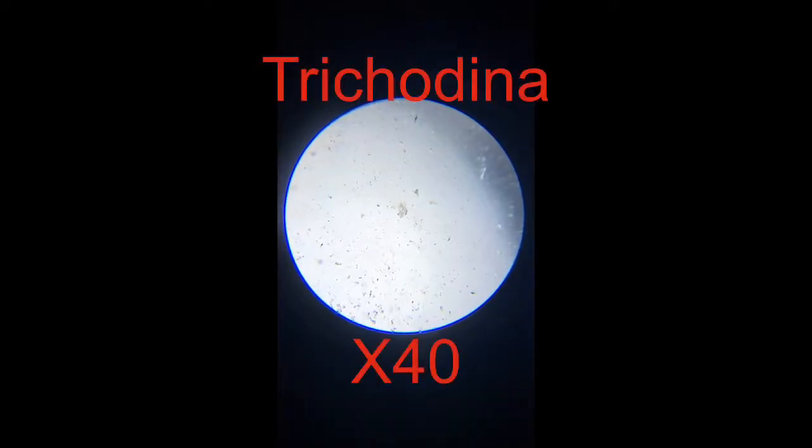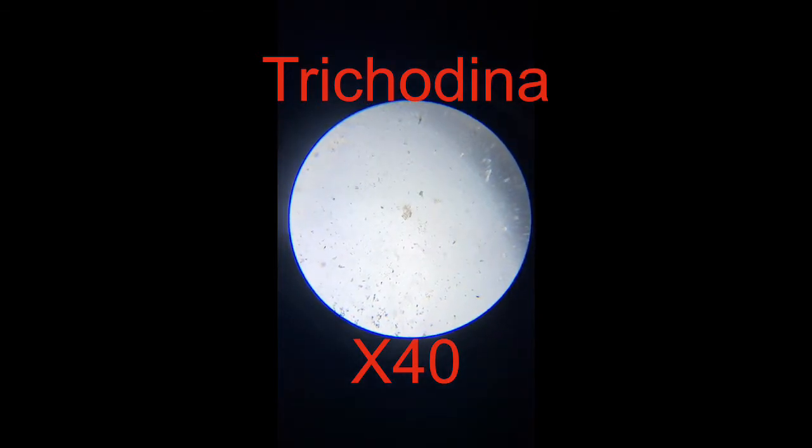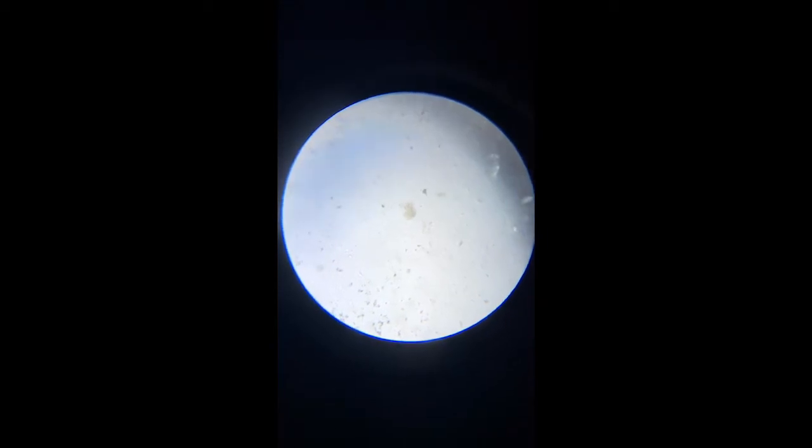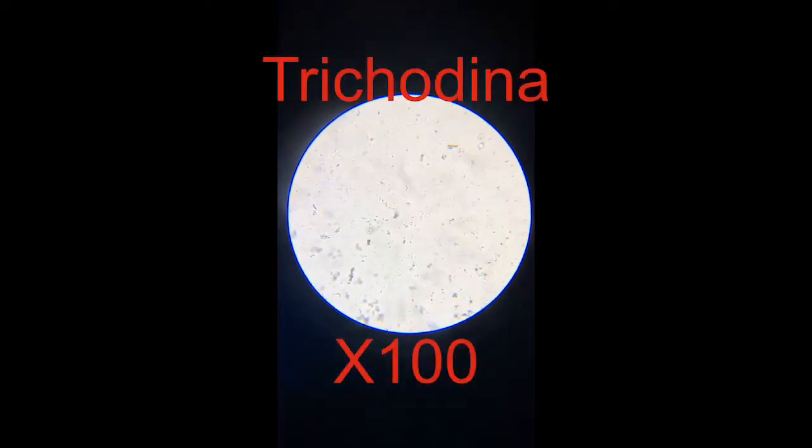We're going to look at various parasites. We're going to start with trichodina, which are small discs that look a little bit like red blood cells, donut shaped. Easier to see under times 100, which we've got here, and you can see that's a very clear pattern.